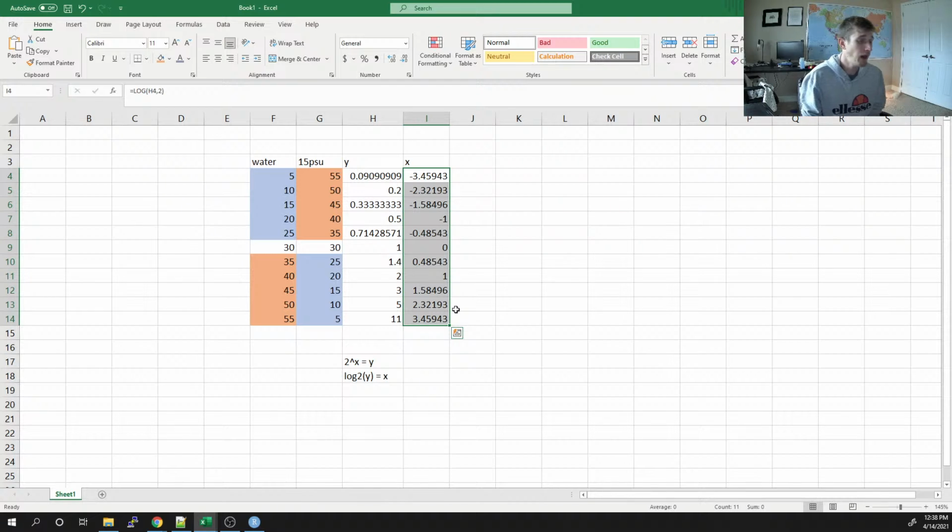And if that number is positive, it tells us that, in this case, genes in water are higher expressed. If it's negative, genes in water are lower expressed. Right? I think that's the more important thing. It just tells us the intensity of the change and the direction.